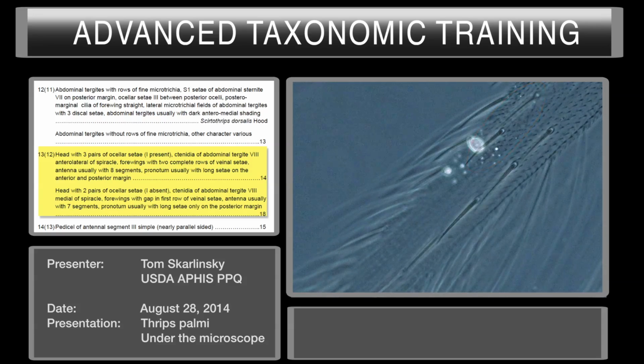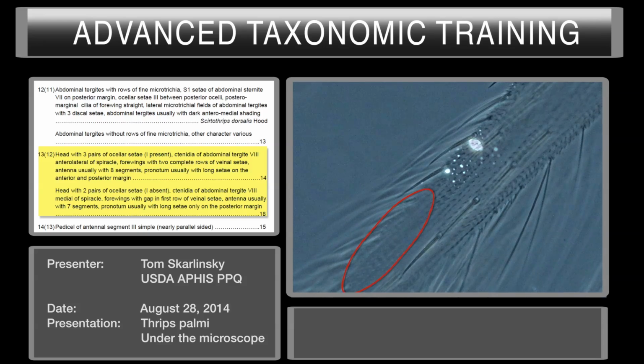Now, if the setae were knocked off during the slide preparation or the manipulation of the specimen, we would see a setal base, not the actual setal base, but its insertion point. We'd see a round circle here, maybe a round circle here, but I'm not seeing anything. So it's clearly these setae are absent here.